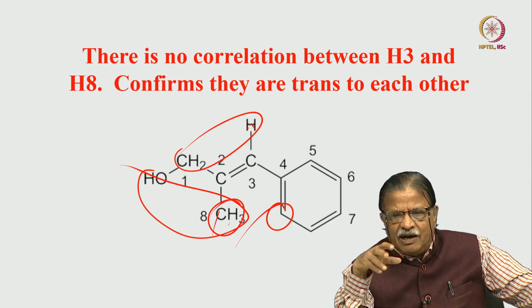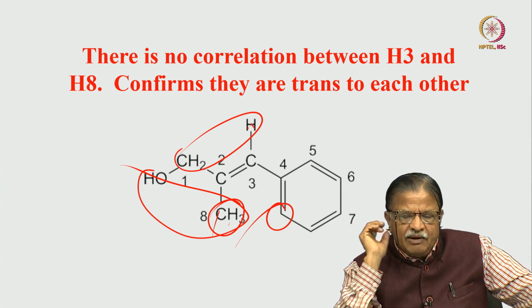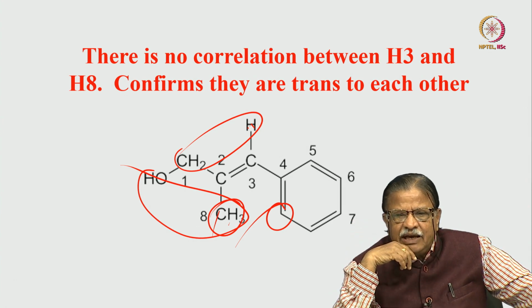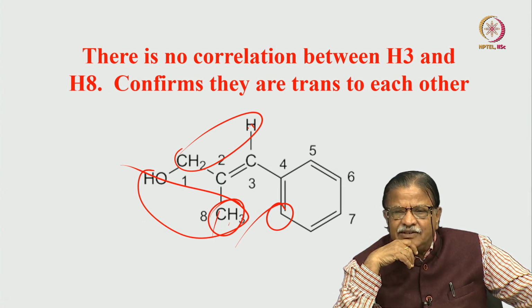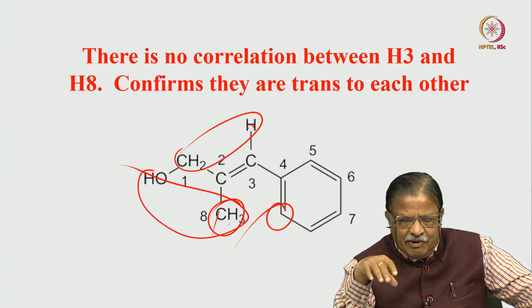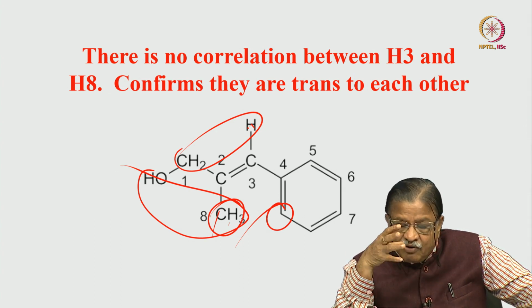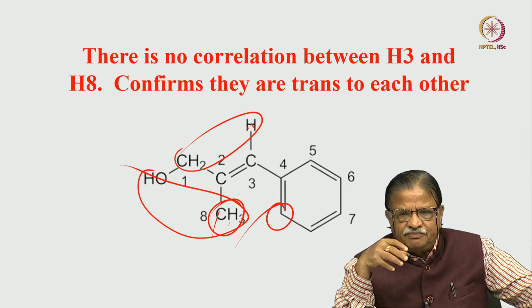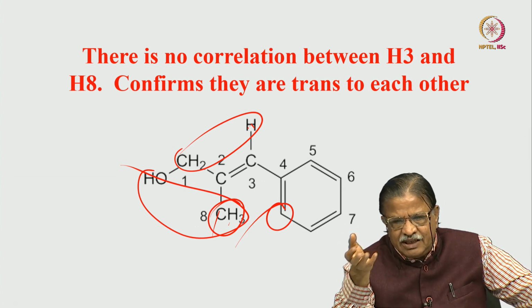Just the 1D spectrum or COSY will give some information. Straight away you can go to NOESY. Based on the correlation information, we could get the structure of the molecule. So we had several examples of molecules which have a double bond, where you could get the cis-trans geometry, and in the phenyl group we could find out the substitution position and rule out all other possibilities just by using NOESY. So these are some of the examples.